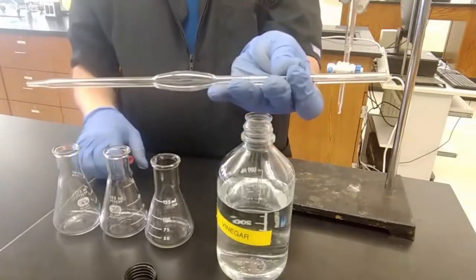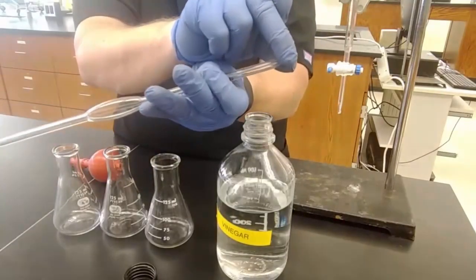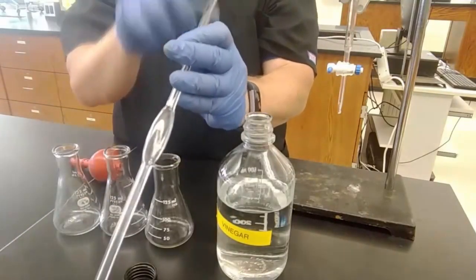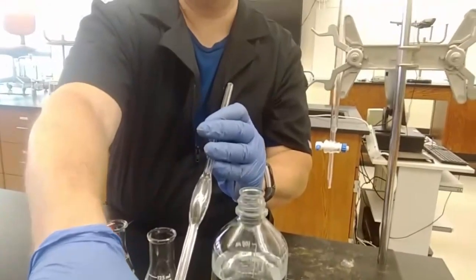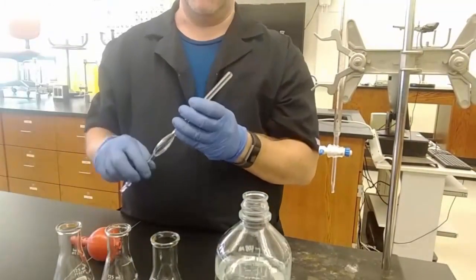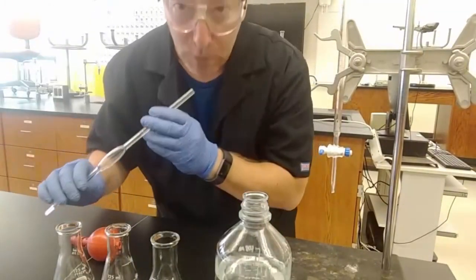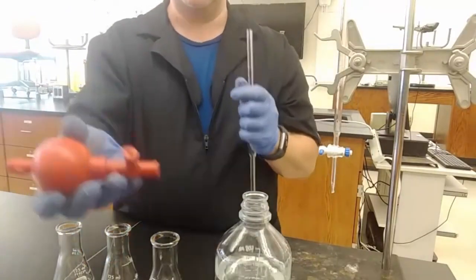In the old school way of pipetting, there was a little hose and a mouthpiece, and you shoved the hose on the end of here, and then you just put the other end in your mouth and sucked it up. That is generally considered to be a big, big no-no in the lab today. Never suck anything up in the lab, and certainly never put your mouth on there and try and suck it up. That's bad news. So you're going to use your pipette bulb.